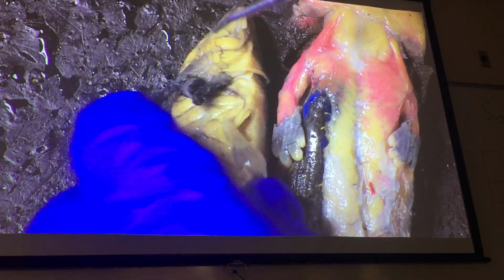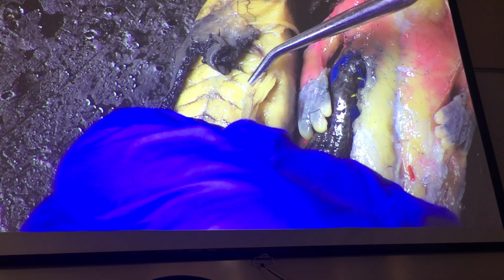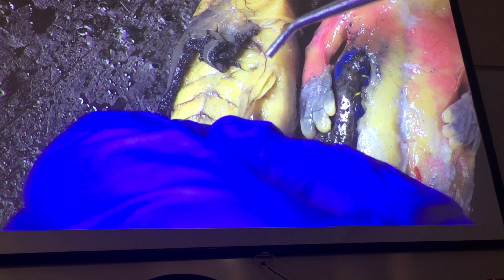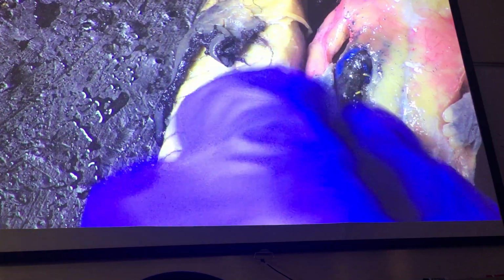On the arms, this is where I think your tiger salamander has a bit of an edge, because most of them have a really well-defined cephalic vein, which helps differentiate your triceps brachii and your humeroantebrachialis. The two arm muscles you may have trouble with are the humeroantebrachialis and the coracobrachialis, but the coracobrachialis is more medial, okay? And the same will be true with your mud puppy.